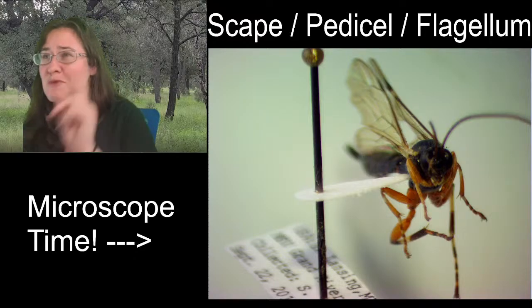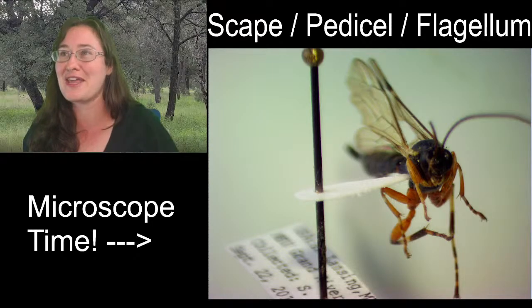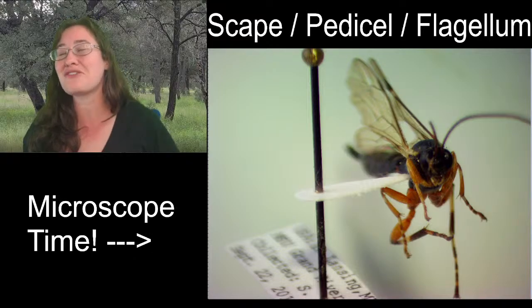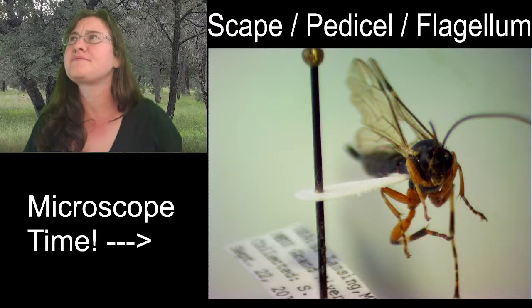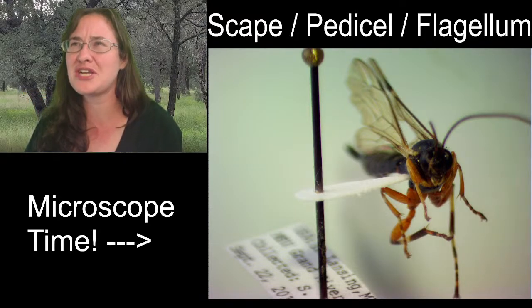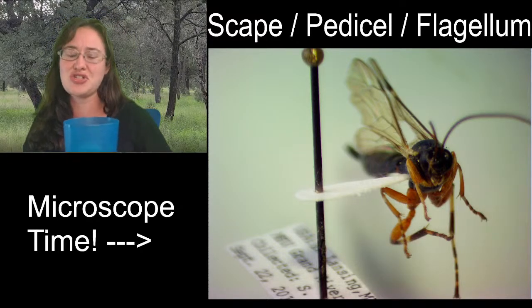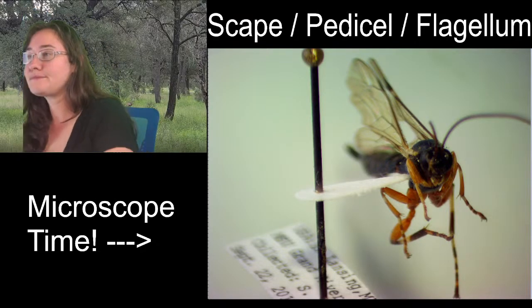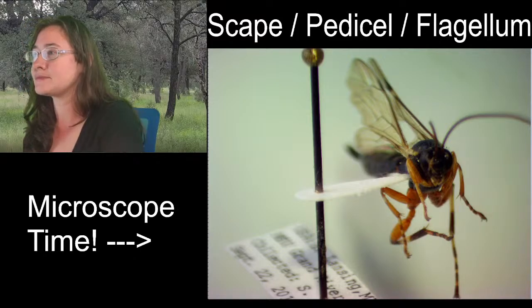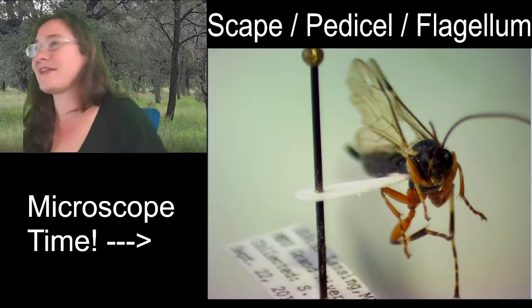Ants are supposed to be, all of them, pointed. I have a number of ants that I just pinned right through the body because I was, you know, saving a little bit of time for myself. But I do know that they're supposed to be pointed. If you talk to a formicologist, somebody who studies ants, they'll tell you that all ants should be pointed rather than pinned. All right, let's zoom in on the head.